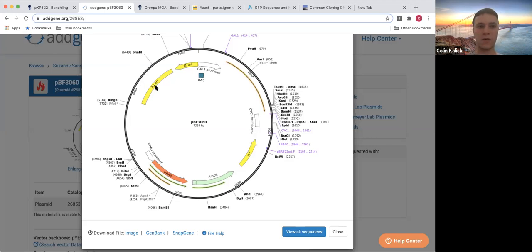Now, what else makes this maybe a decent backbone or a blank backbone? Because you can see some other things here. You have an AMP R, and that just means ampicillin. Oh, actually, one question before we continue on why it's important that you have different machinery. Can you guys talk a little bit, maybe questions? What are some differences between prokaryotes and eukaryotes? And so why is it important that we specify certain machinery for prokaryotes versus eukaryotes, or specific species, maybe even of bacteria, or mammalian?